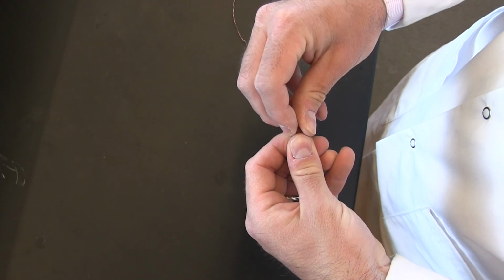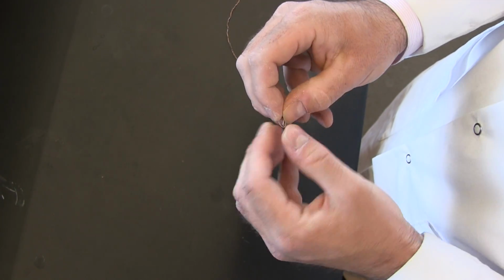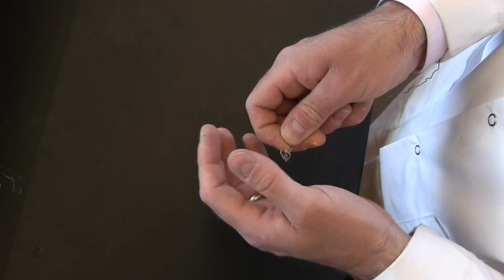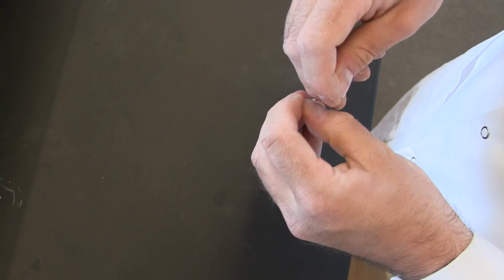Mr. Falk is filling in for Taz today. Here he rolls the magnesium into a spiral. And now he is threading the copper wire through the magnesium and wrapping it around to make a cage.